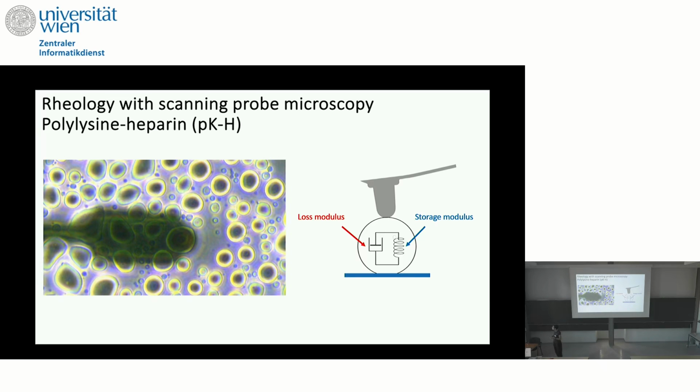We used poly-L-lysine and heparin condensates. So I have to go back to the great talk of Matthias Balloff that was telling us about the interactions of glycosaminoglycans with positive counterparts. But the reason we chose poly-L-lysine and heparin was actually a bit different. We chose it because the reagents you can buy them. They are commercially available, and they're not even that expensive. When you mix the system in a buffer with some crowding agent, you actually get quite stable condensates.